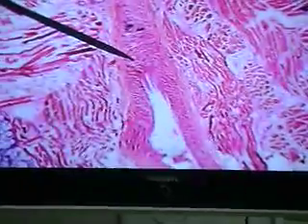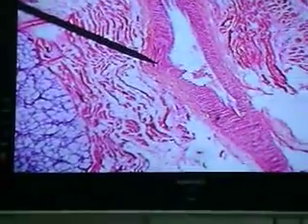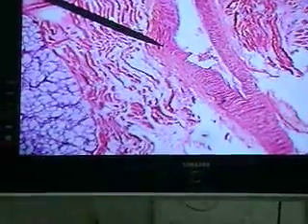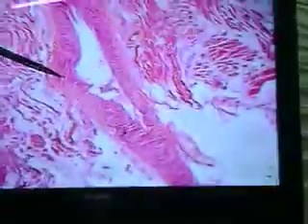Now, there's a man here by the name of Professor Sean Knowles from the Bahamas or Cayman? Bahamas. Now Sean, what are we looking at here in cross-section? What is this animal that we're looking at here? What are we looking at here? Professor Knowles, what are we looking at here? We have a more senior professor and a more junior one. Courtney is a more junior one.